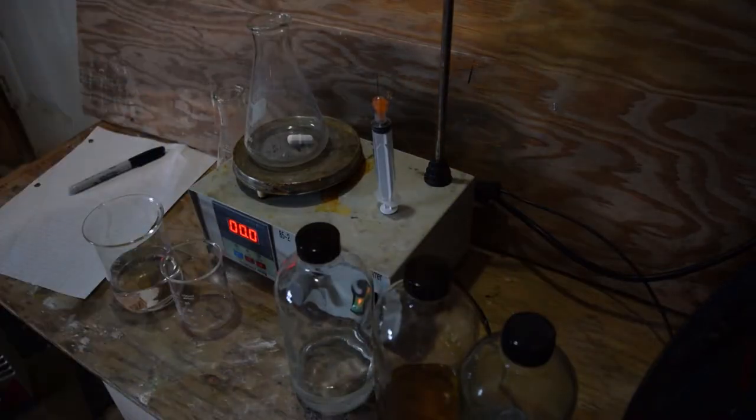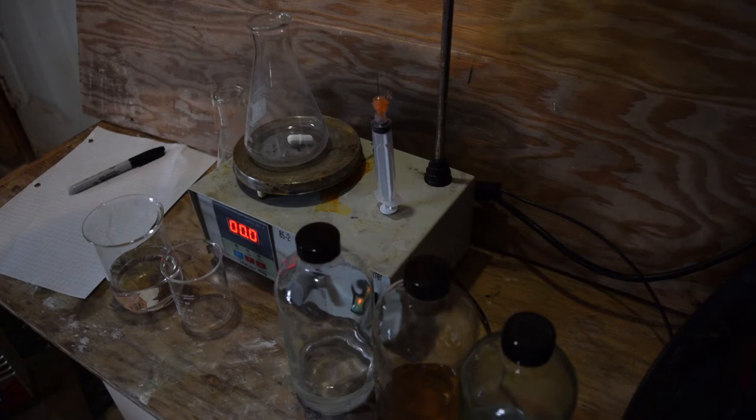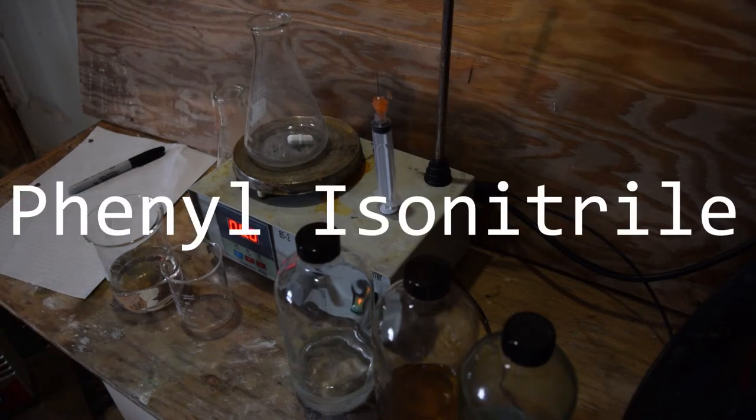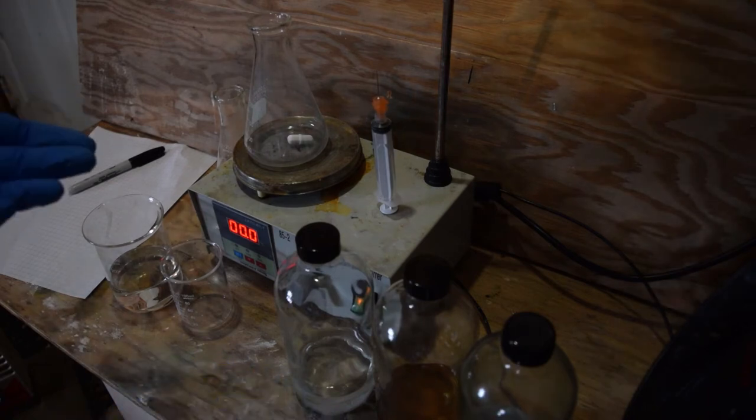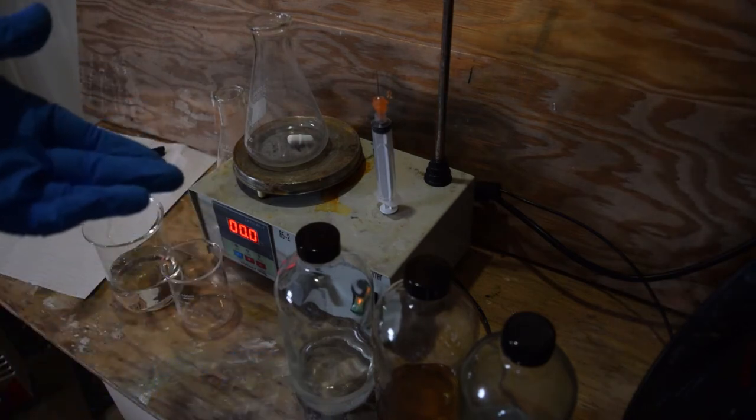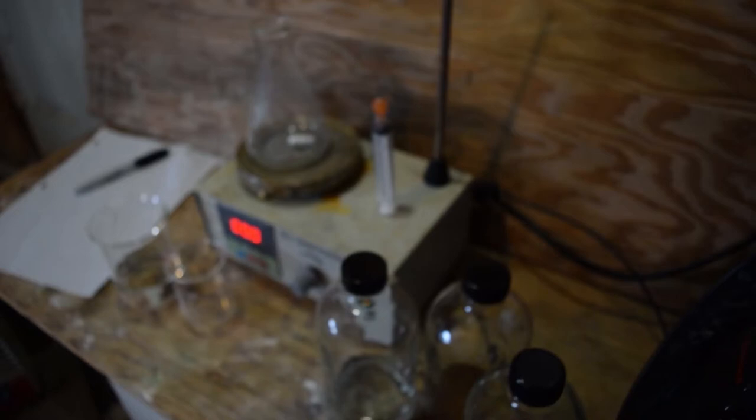Okay, what we have here is all the reagents needed to make a compound called phenyl isonitrile. Now why am I making this? Well, it smells a lot and not good either. These are the reagents we'll need for this synthesis.